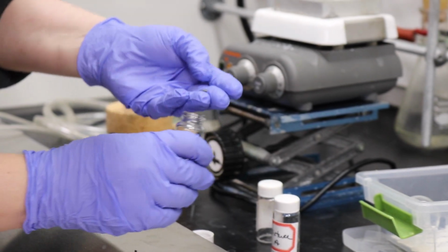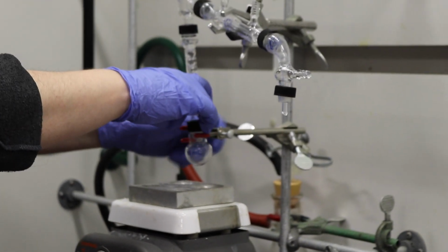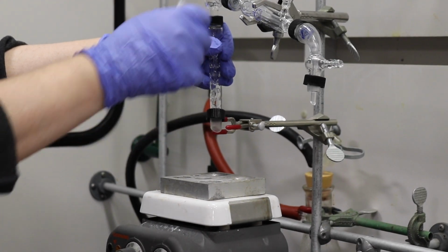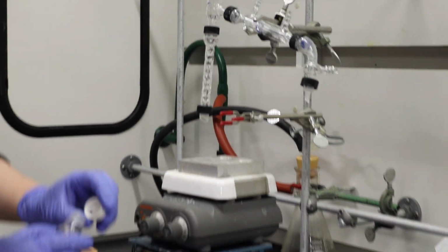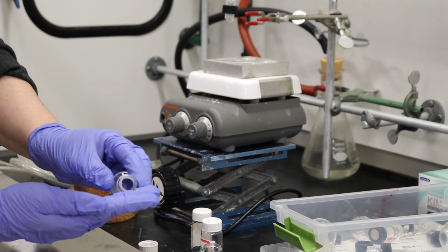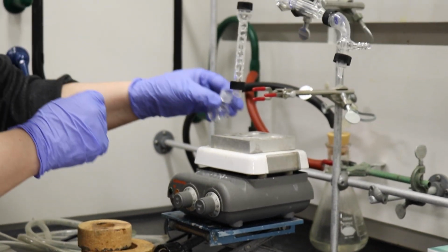Now we also have to put a boiling stone, just as we did with simple distillation, into the round bottom flask. Here it's easier to disconnect the round bottom flask than to drop it down through the Vigreux column. So we disconnect the round bottom flask, make sure the rest of the skeleton is secure, put the boiling stone into the round bottom flask. I think we maybe needed one more. We're putting it in, as you can see here. The boiling stone is in the round bottom flask, and now we're going to connect the round bottom flask to our system.